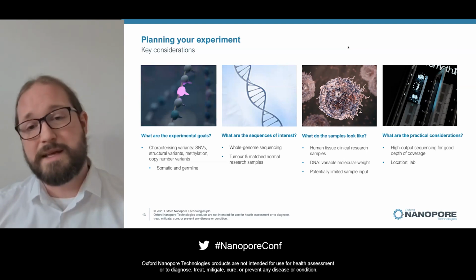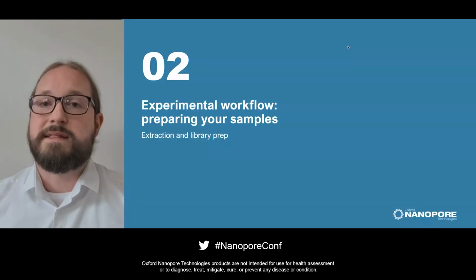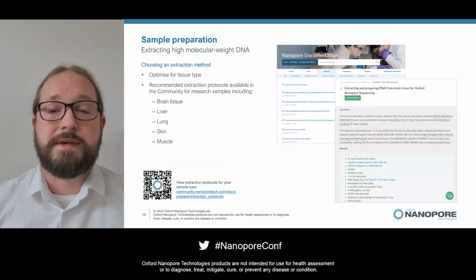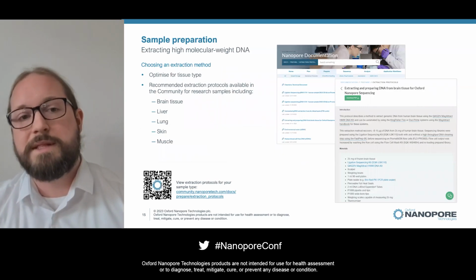So this is again the end, roughly thinking about what we want. So next, how do we get there? How does this translate into an experimental workflow? We'll start with DNA extraction. The main goal here is you want to extract high molecular weight DNA.